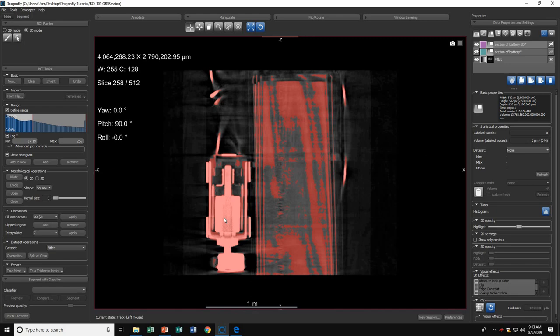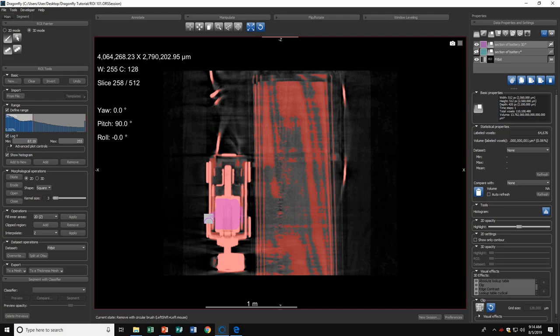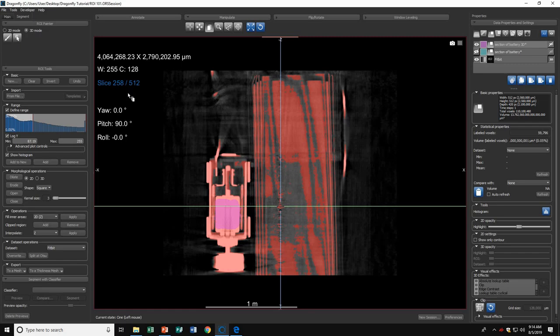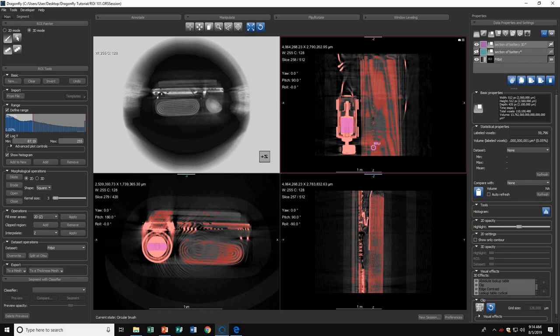I'll choose to highlight this section. In 3D mode, the controls are exactly the same: left control and left click to add a region, left shift and left click to remove. I'll use the round brush and paint this section. Now if I look at multiple slices, notice how I only painted on slice 258, but if I move through the different slices, Dragonfly has highlighted the same region throughout multiple slices.